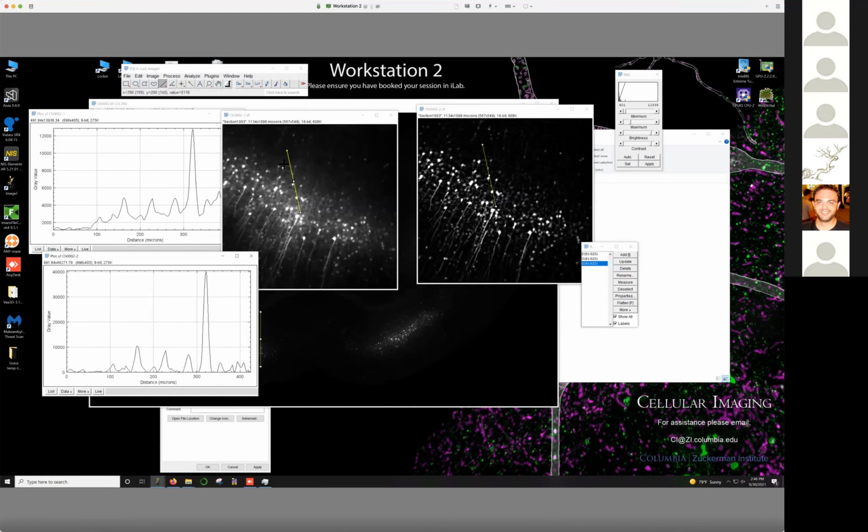The best way to describe it is it's like rolling a ball across the image, and you're setting the size of that ball. If you flip these, you can imagine the ball rolling across this surface, and we've made it big enough so that it doesn't fall into these valleys. That way it can record the slope of the background, and we can subtract that away. We're left with peaks that are sitting nicely above 0, and it becomes a lot easier to do the analysis.